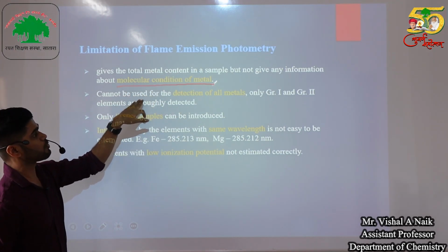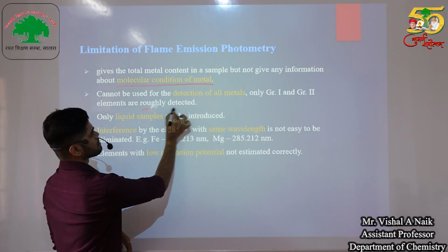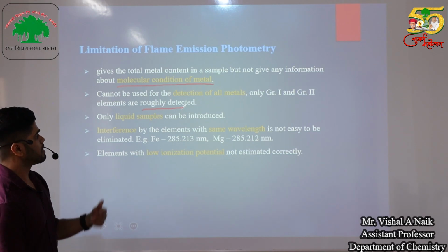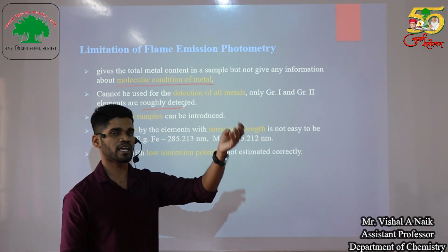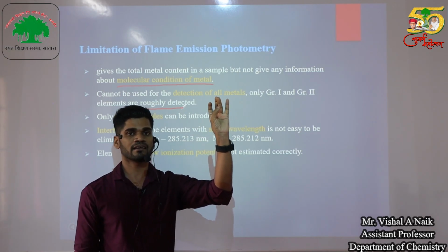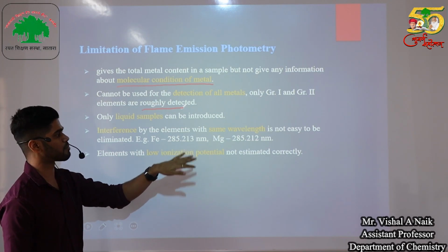Then it cannot be used for the detection of all metals. Only group 1 and group 2 are roughly detected. Then only liquid samples can be introduced into a flame emission spectrometer. We cannot analyze gaseous samples and solid samples directly in flame emission. Only liquid samples are determined.